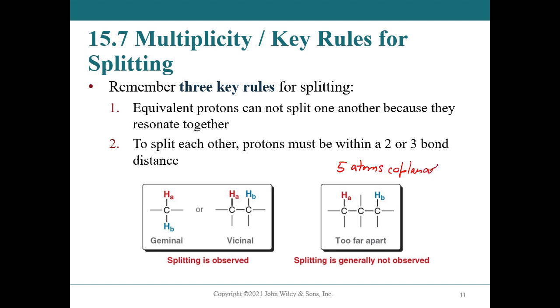And we see that in aromatic systems. Sometimes you will see it in bicyclic systems where you've got 2 rings that are fused together that hold it rigidly and specifically so that they're all coplanar. You don't see that a whole lot outside of aromatics. And if it's a big floppy molecule, you won't see that. So long chains, we don't see the 4-bond coupling. Right.